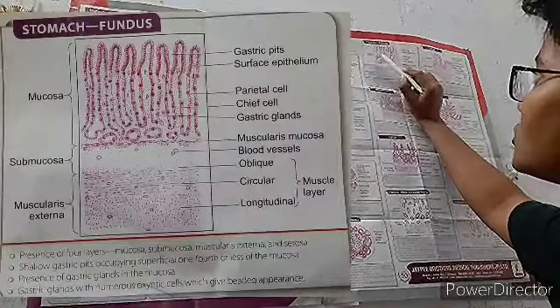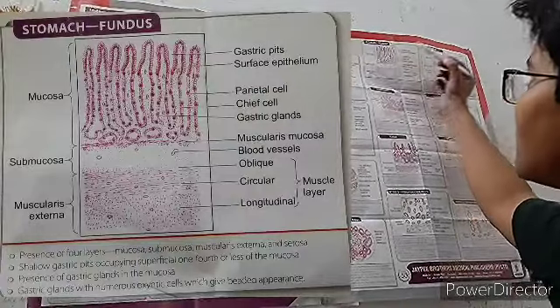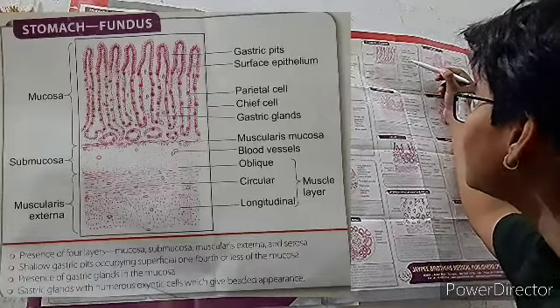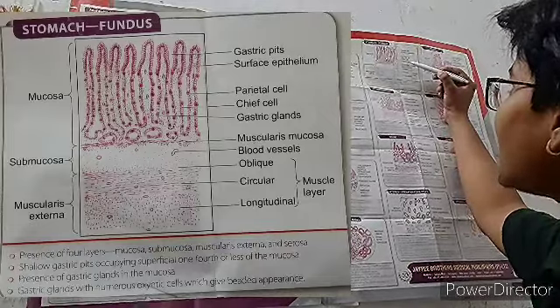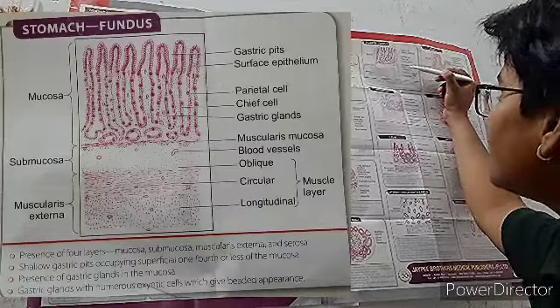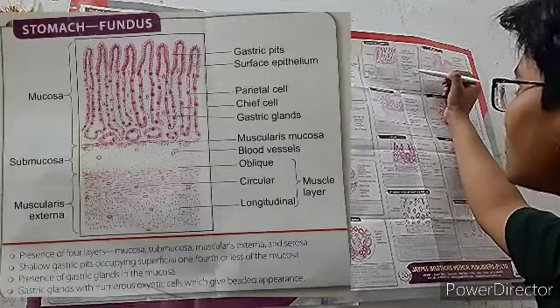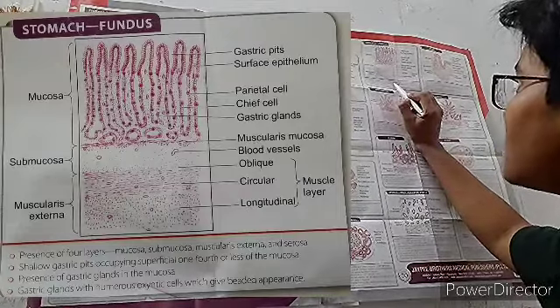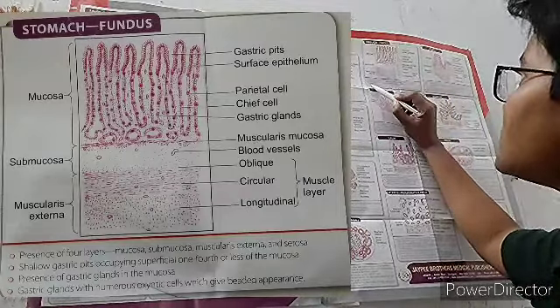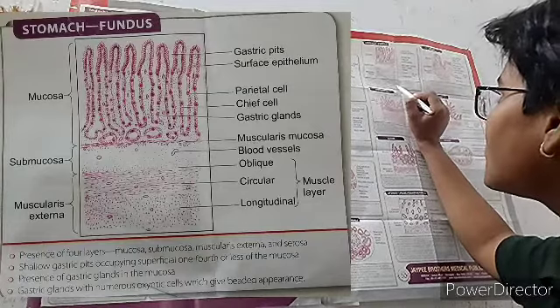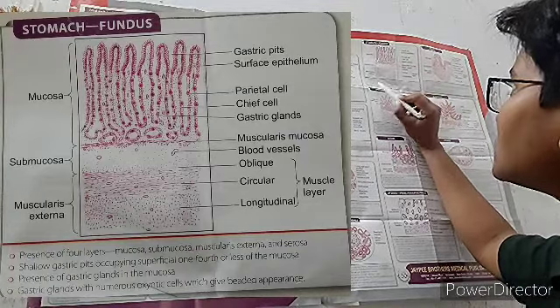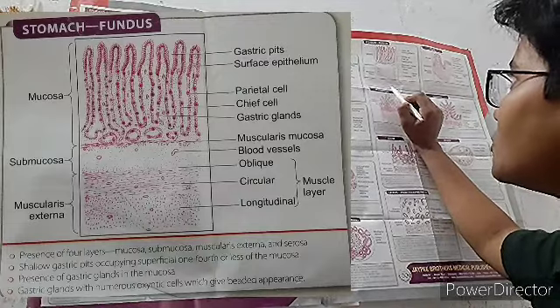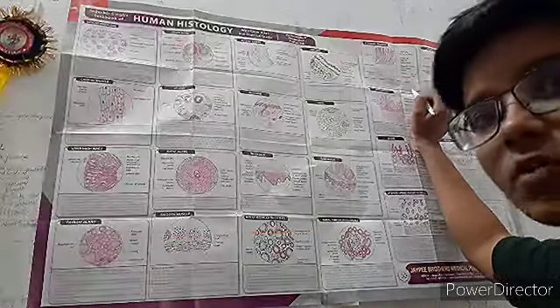Now the stomach, fundus. Visible structures include mucosa, submucosa, muscularis externa, gastric pits, surface epithelium, parietal cells, chief cells, gland cells, gastric glands, muscularis mucosae, blood vessels, and oblique, circular, and longitudinal muscle layers. The stomach has the full four layers: mucosa, submucosa, muscularis externa, and serosa. Shallow gastric pits occupy the surface — one-fourth or less of the mucosa. Gastric glands are present in the mucosa, and are numerous with oxyntic cells showing a beaded appearance.